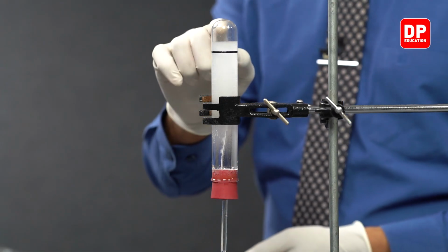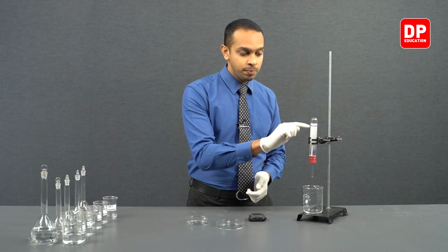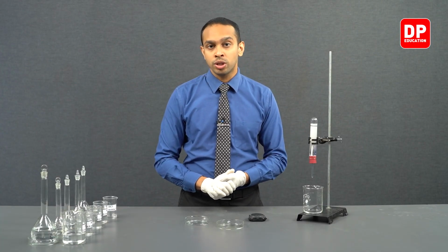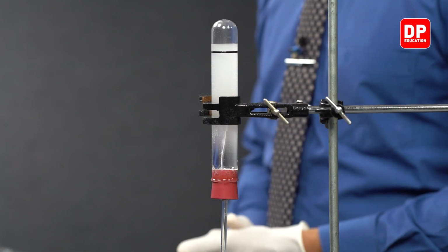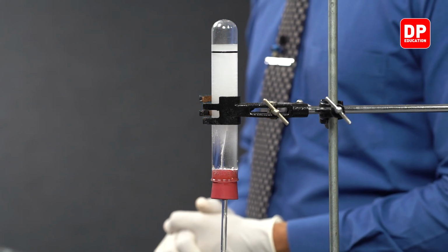So we want to observe the water level at this black mark that we have over here. As the water level gets down to this black mark, we will stop the stopwatch and take note of the time it took for hydrogen gas to get collected all the way down to the mark that we have made on the boiling tube.